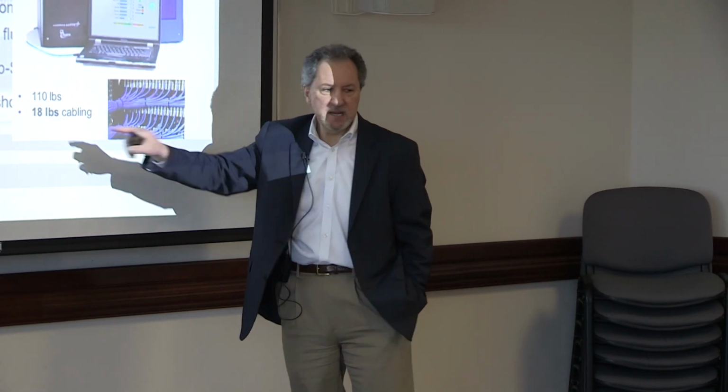Cost possibly sub $5, but this is to be determined by Dr. Root. But this is the important one. It's 10 pounds and it's roughly the size of 2 reams of paper. And just to baseline that, this instrument, which is over at Microlab still, is 110 pounds, 18 pounds of that 110 was cable. So we've now built an instrument that does the entire thing and weighs half as much as the cabling that is in the fully integrated system.